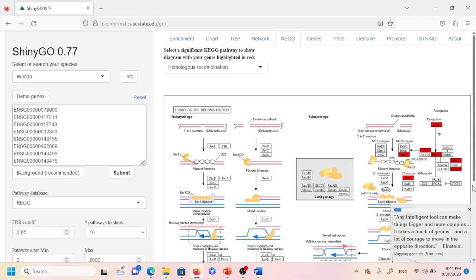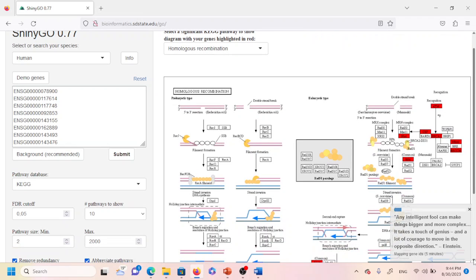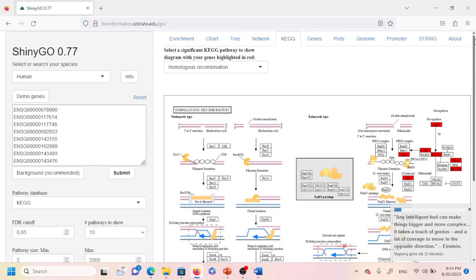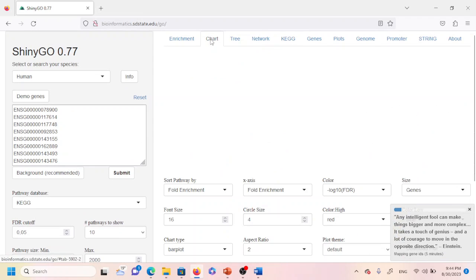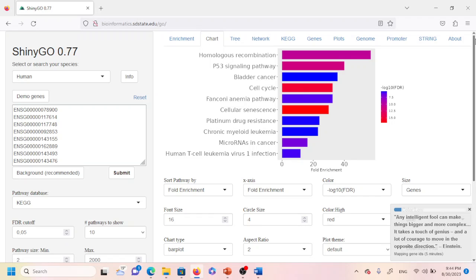Going back to KEGG, you can now see the significant KEGG pathway diagram with our genes highlighted. As a beginner, the most important output is the chart — it shows that the list of genes is associated with these enriched pathways. That's what KEGG pathway analysis tells us.